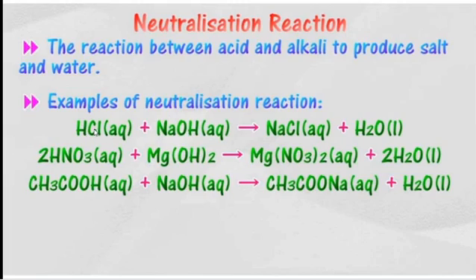This is the acid, hydrochloric acid. This is the base, sodium hydroxide. This is a base or alkali. Alkali means bases dissolved in water. This is called an alkali. Base plus acid: one acid and one base reacted together to form a salt and water.